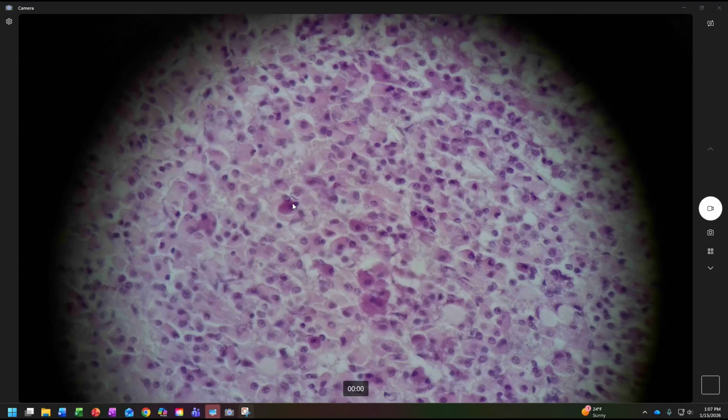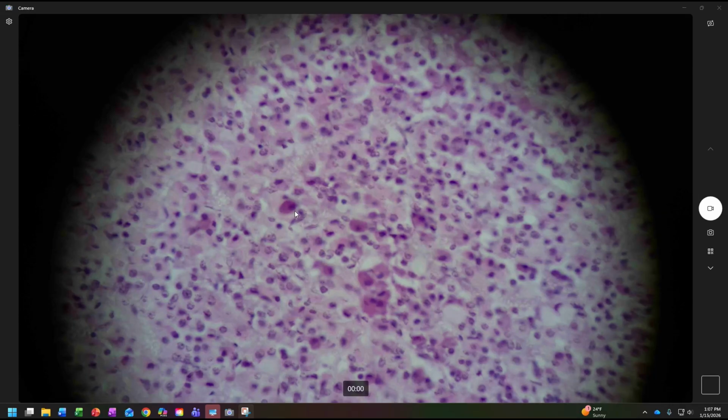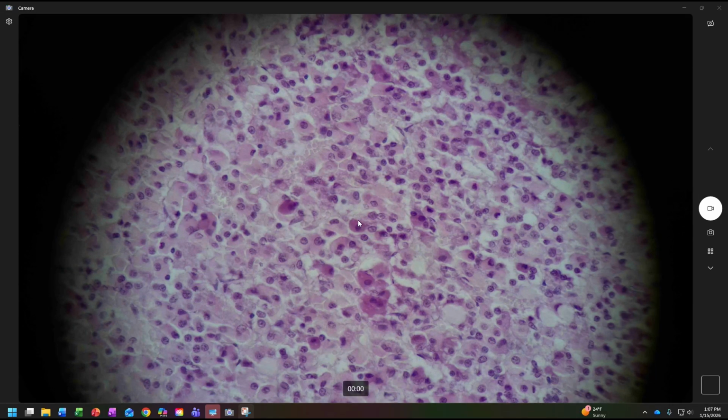It could be an artifact, which is something that shows up that looks a little different, but it doesn't mean anything. It's just kind of an accident. It could be that. I don't know, but I can definitely see these cells here are staining a little more. They're taking the stain up a little differently. Does that mean they might function differently? Heck, I don't know. But anyway, cells packed together, grainy, gives us that dark appearance.